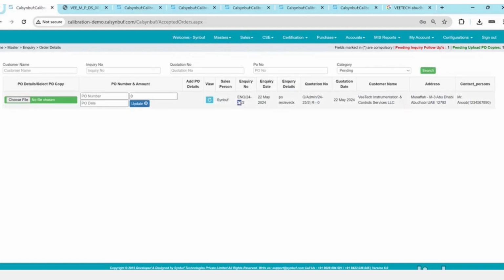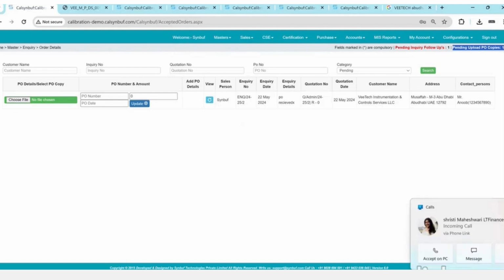Now see, pending PO upload copies. Basically, some customers, sorry, sales executives are doing this: they are closing inquiries and getting POs, but they are not uploading the PO to the system. Many times we are not able to retrieve the PO copy, right?